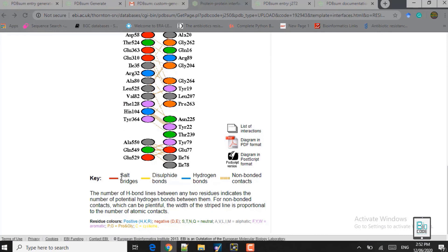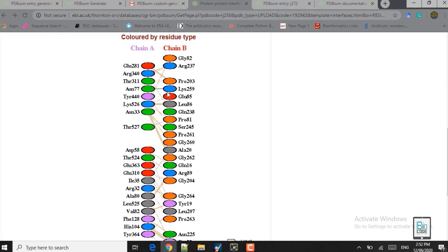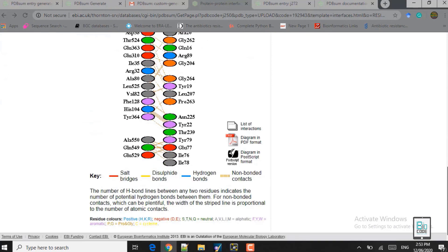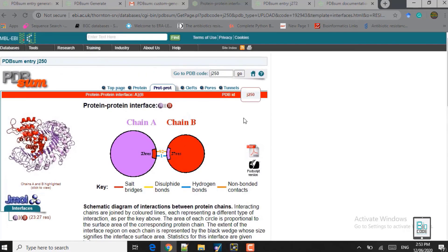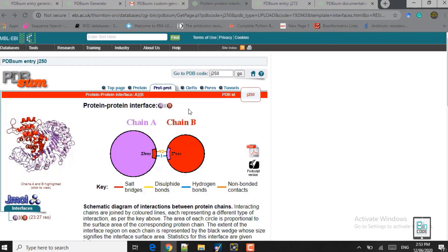Here you can see: there are no salt bridges, no disulfide bonds, only one hydrogen bond, and 92 non-bonded contacts. The dashed lines you see here are the non-bonded contacts. The blue line between ASN 77 and LYS 259 is the only hydrogen bond in this complex. There are other options such as clefts, pores, and tunnels, but we are not concerned with those in this lecture — we will cover those in later lectures.